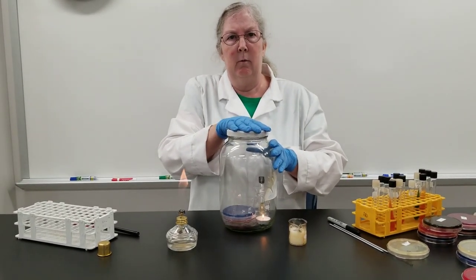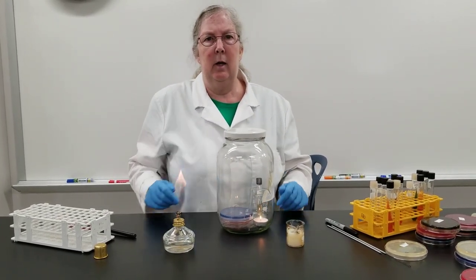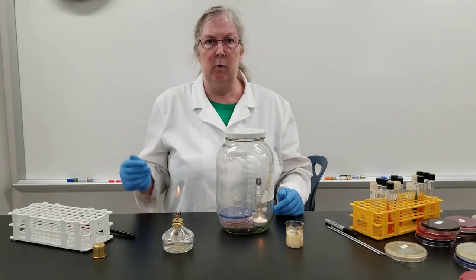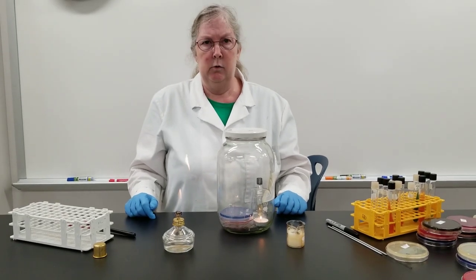Then it will go out, and when it goes out it has lowered the oxygen level inside the candle jar, and this is how we will incubate both the plates. We incubate them upside down, just like you would in the normal incubator, and we also have the test tube. All of these have been inoculated hoping to grow streps.